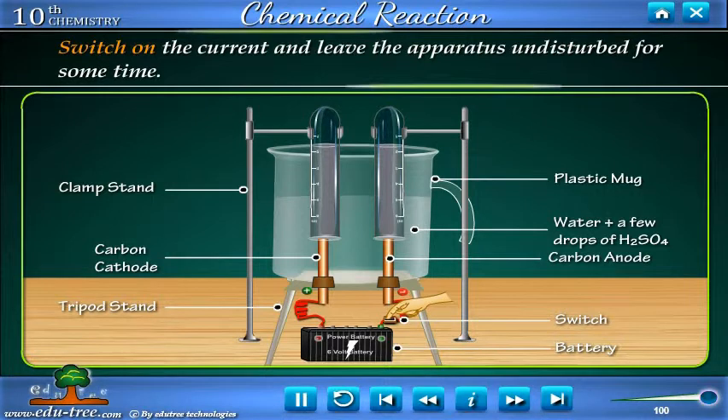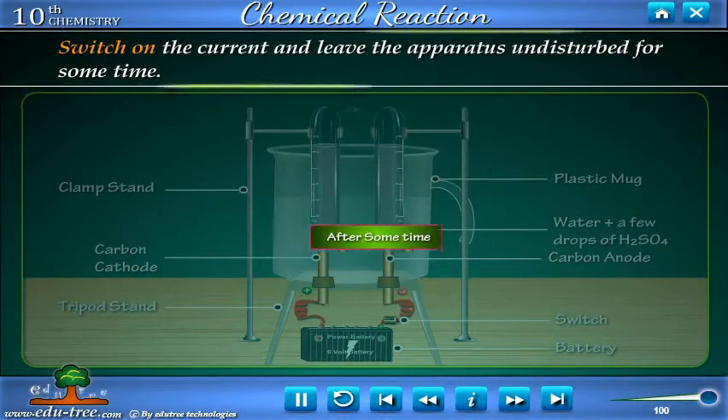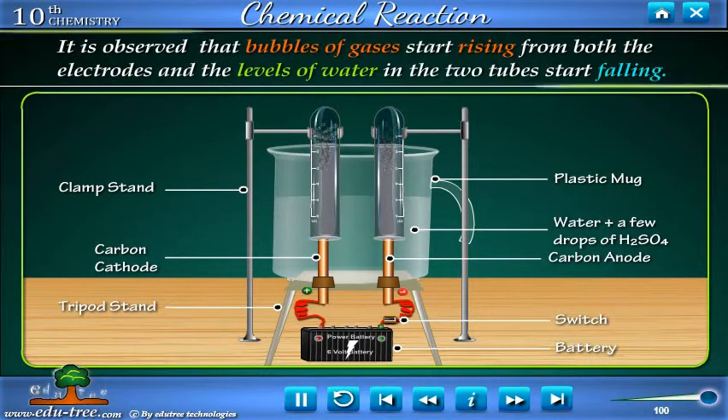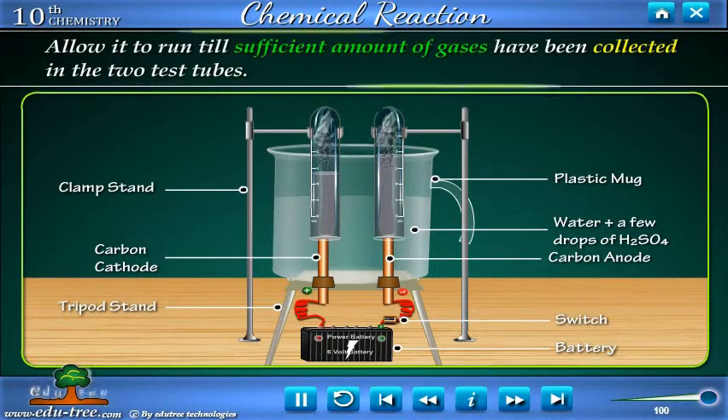Switch on the current and leave the apparatus undisturbed for some time. It is observed that bubbles of gases start rising from both the electrodes and the levels of water in the two tubes start falling. Allow it to run till sufficient amounts of gases have been collected in the two test tubes.